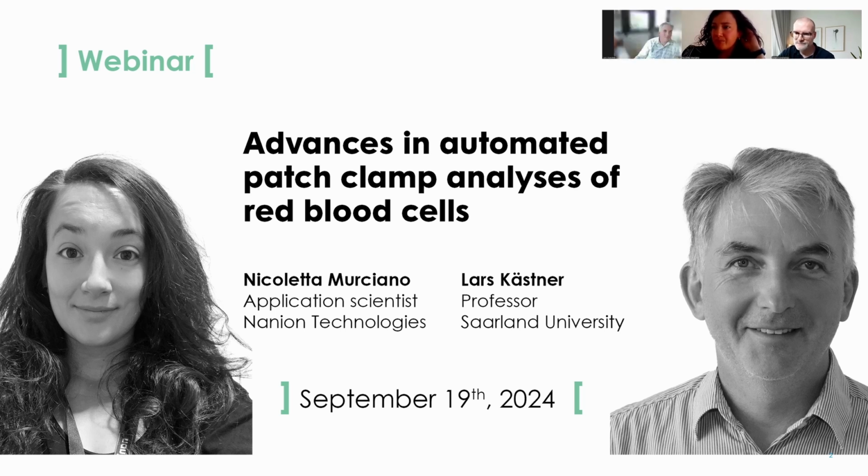One of the reasons that I was attributing the non-responding of red blood cells to mechanical stimulation, for example, is the tension of the membrane of red blood cells in the whole cell configuration in the planar patch clamp. So my hypothesis can be that due to the high deformability, the cell is trapped inside the hole, and so the membrane exposed to the mechanical stimulus can be not at a good tension.